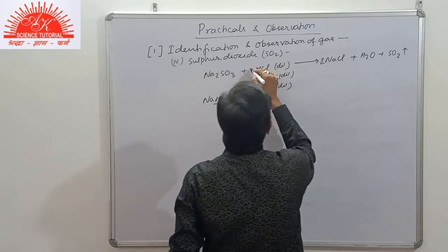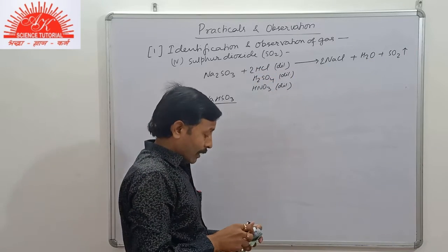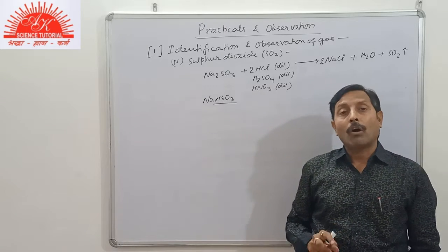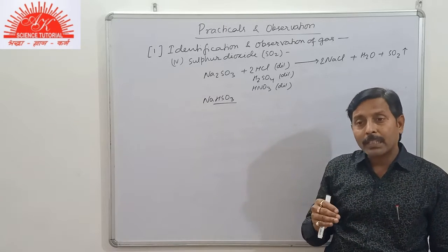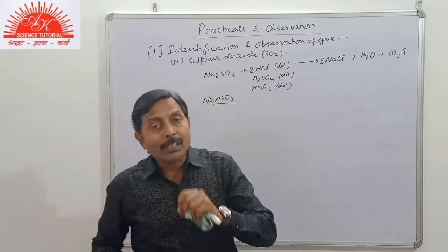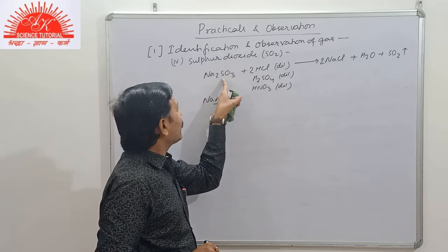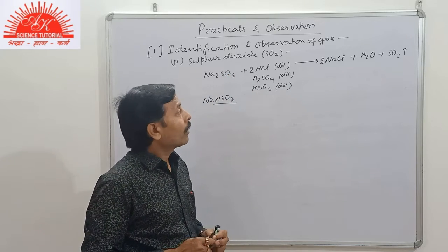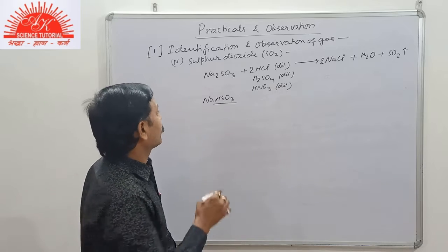Now students, you see that the chemical reaction or equation of sulfite with acid is similar to that of carbonate. Just in place of C, here S means sulfur is used. Now how will you write here?